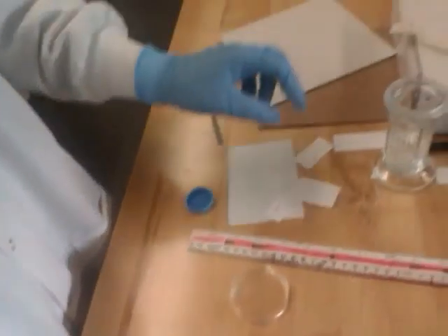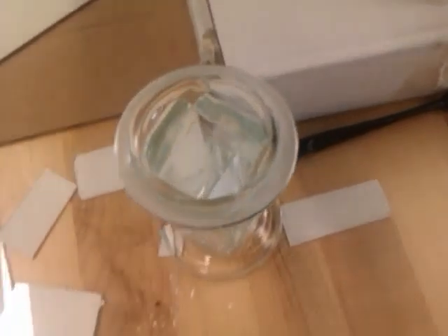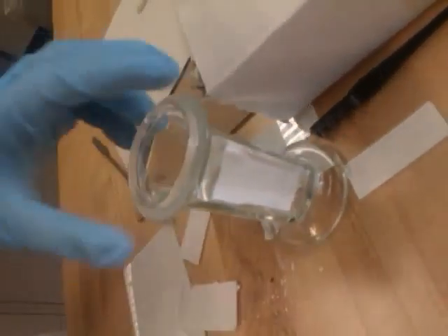Now, once you've spotted everything, place it in your TLC chamber. Leave it for 20 to 30 seconds with hexane at the bottom.